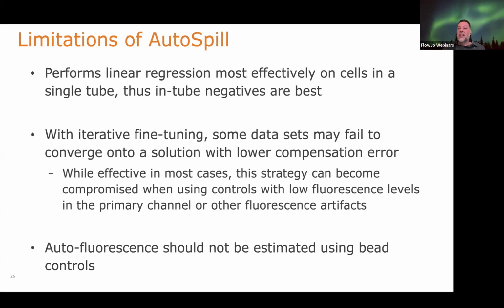Beads usually, but in most cases, full spectrum cytometrists are trying to mix and match depending on their needs. And if you have to go to beads, that's fine. You've got to do what you've got to do to get a good signal. It's better to have a nice positive signal, I think, than a poor one. Simple as that for calculating compensation. But it's a good point to make, right?